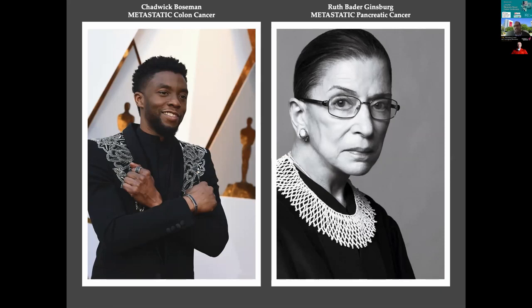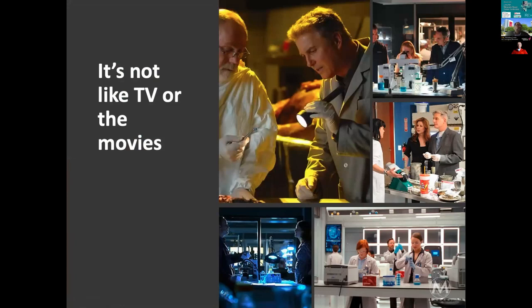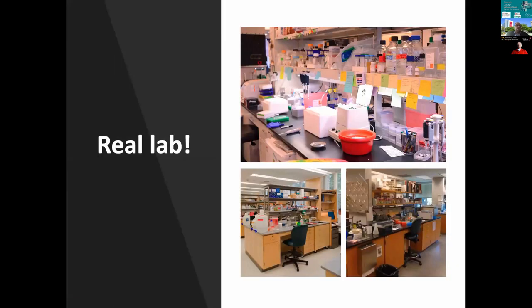Now, how do we look at metastasis in the lab? And I want to bring you into this. Everybody imagines cancer research as not like Breaking Bad, or the things that you see on TV and movies, where we get a DNA sample in the morning and then we unravel everything by nighttime. This is how a research lab looks normally. As you'll see, and a lot of my colleagues can attest to, we have our bench tops, our different tools that we use, pipettes, all of our grad students, postdocs, and Post-its everywhere. And so I want to bring you into what a research lab really looks like, and how do we study cancer cells within a dish?